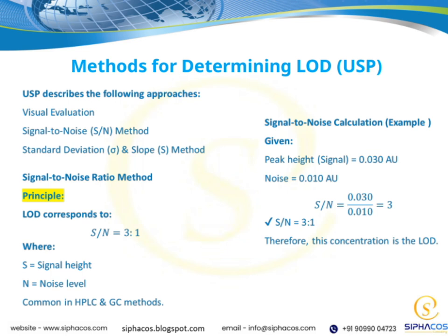These methods are essential because they help us establish the sensitivity of our analytical method. And, as we move forward in the presentation, you'll see how these detection limits are integrated into broader validation parameters to ensure the reliability and robustness of our methods.